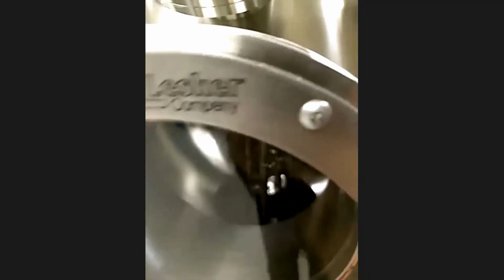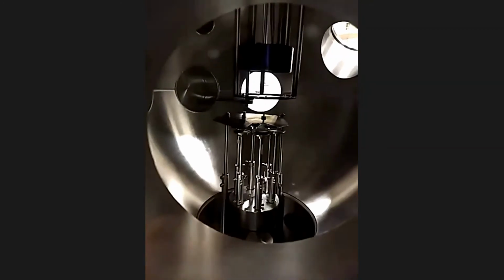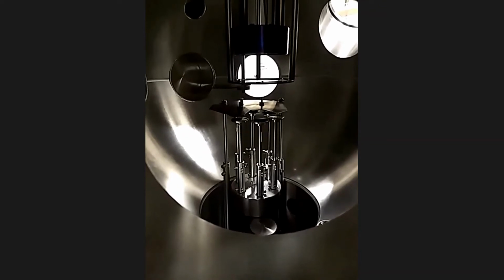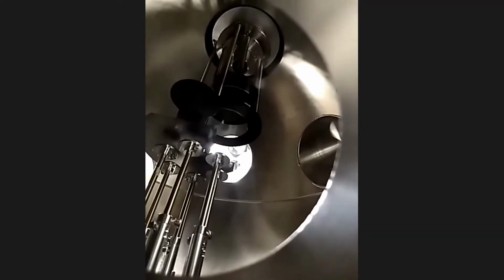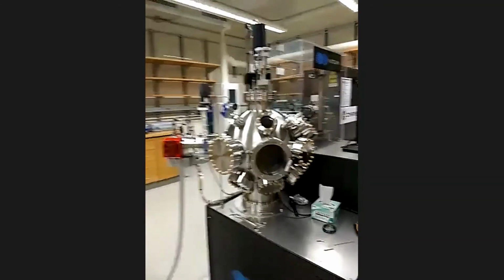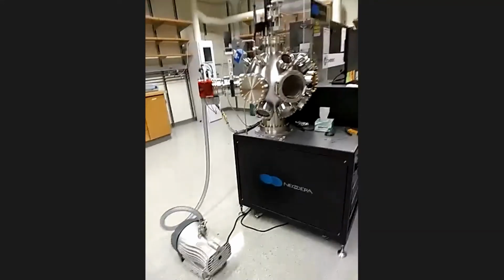Maybe it's hard to see, but let me try. Okay, yeah, it's hard to see, but there are pucks on the bottom, and that is the area where the plume is going to hit. Once the plume hits there, inside this PLD chamber, we have our thin films. And this pump is what creates the vacuum here.